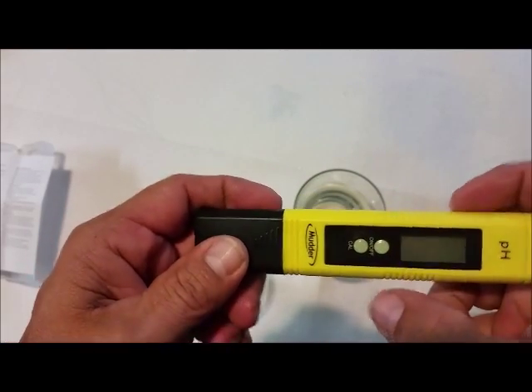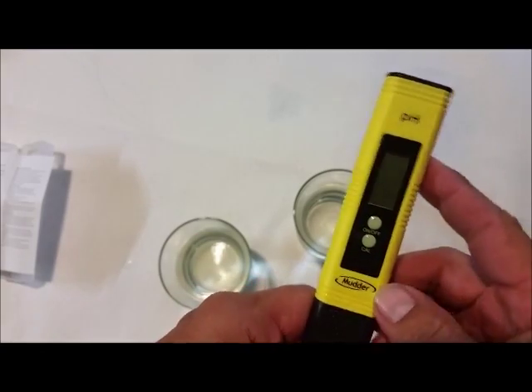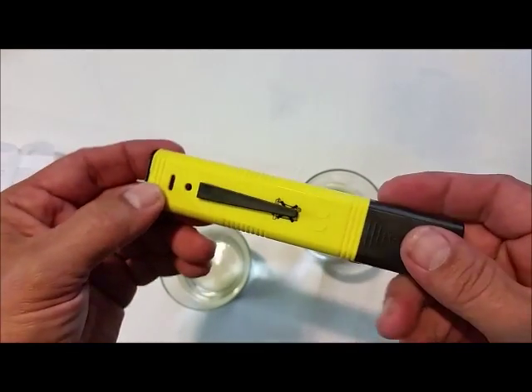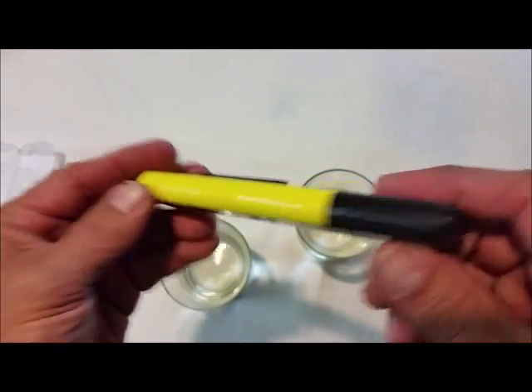So you use a calibration switch whenever you go to calibrate it. There's your pocket clip. Battery compartment. Good little unit though.